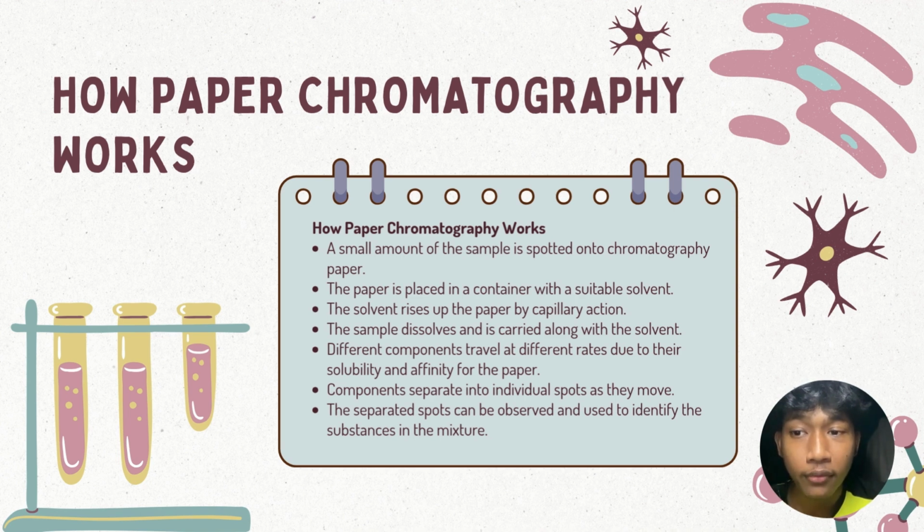Different components travel at different rates due to their solubility and affinity for the paper. Components separate into individual spots as they move. The separated spots can be observed and used to identify the substances in the mixture.